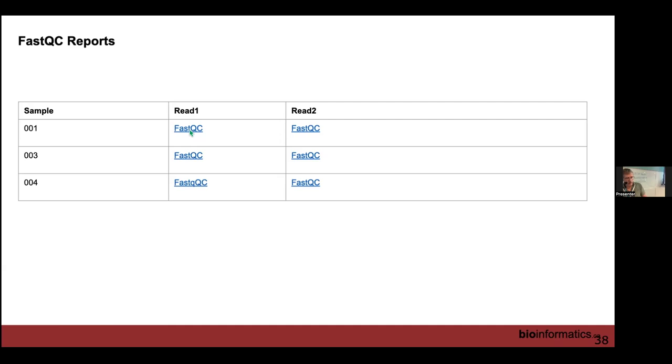You may get contamination of adapters in your sequence data, and that's something we can look at here as well. I'm going to show you another report quickly with another data set I generated. This was actually generated from the original data set, but I just enriched it for all those sequences that have adapter. Okay, there is adapter contamination across the whole thing.